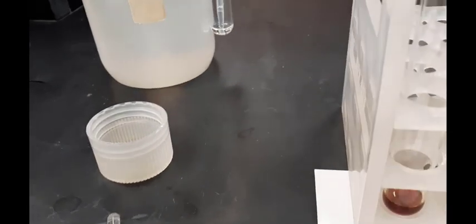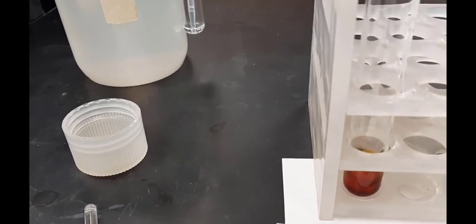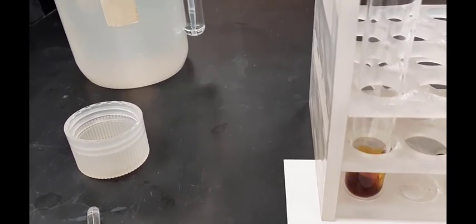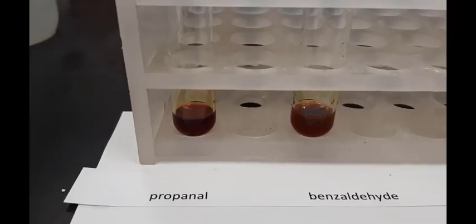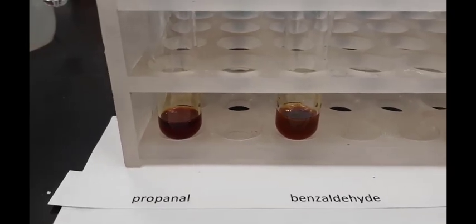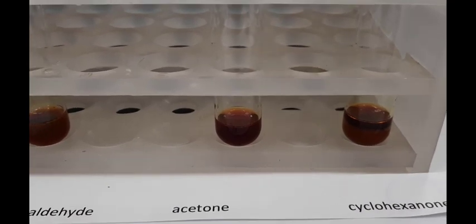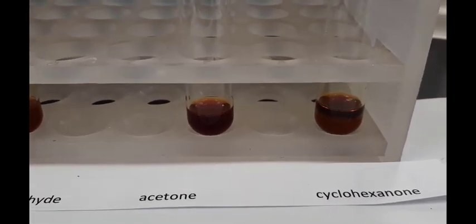Now, rather than showing me adding the solution to every one of the test tubes, I'm just going to show it for propanal. Here you see the test tubes after the 20 drops of each ketone or aldehyde have been mixed with 20 drops of the iodine solution.